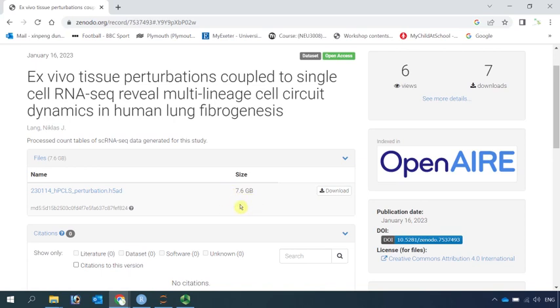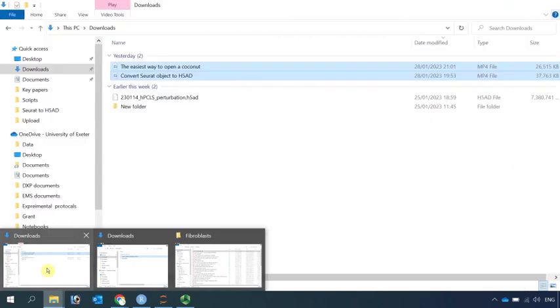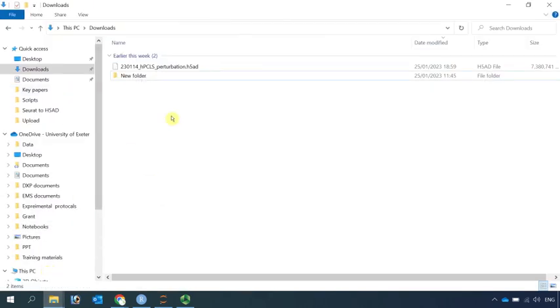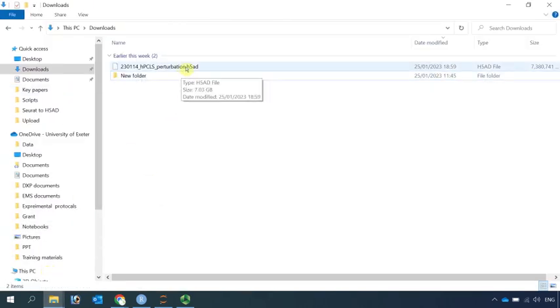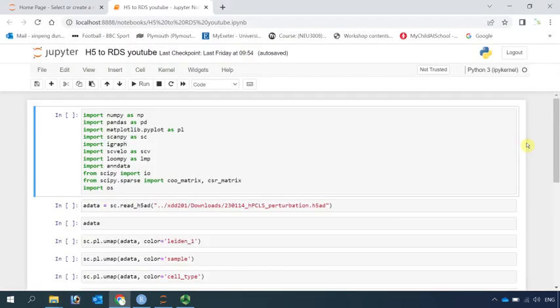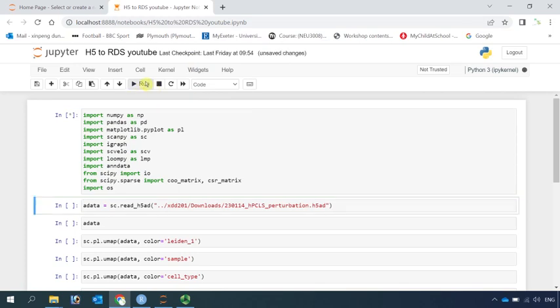I downloaded it already in my downloads folder. You can see the H5AD file. So now we can read this H5AD file into Jupyter Notebook. First, we need to load all the dependencies. So let's read the data into Jupyter Notebook.